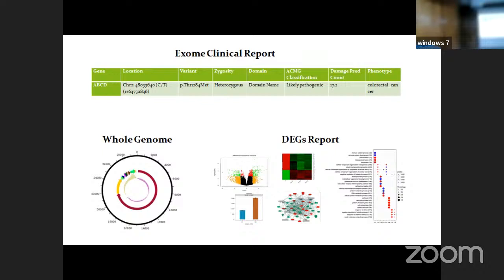Now, technically, if you look at transcriptome analysis research papers, you will find that people used to report the top 10 up or top 10 down. This is a pretty simple way. But the top 10 are highly overexpressed or highly downregulated. They might be, I'm not saying that they may not be. But some other gene which is at the borderline might be inducing these 20 genes to express this much higher. And more often than not, you will find these top dysregulated genes might be common in all diseases. Then they cannot be biomarkers. If they are overexpressed in all diseases, how can they be biomarkers or drug targets, right?